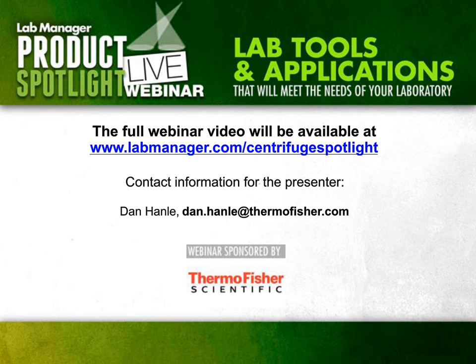And if you've got a vacuumated centrifuge and a refrigerated one, you want to wipe the rubber gasket a good bit. Don't let that thing get sort of eaten up. They usually don't. It's the O-rings that go quicker if they're not properly taken care of. But still watch that, because you are relying on that big piece of rubber around the top to help you either get a vacuum or hold your temperature. So that's important too.